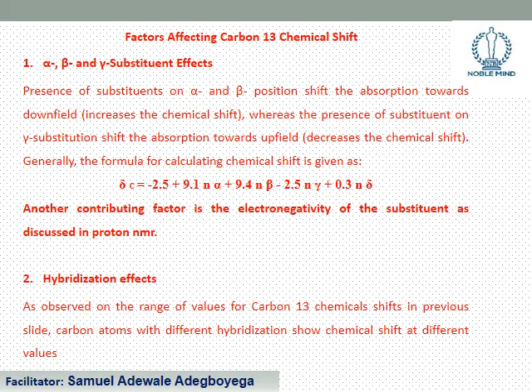You say an increase in chemical shift. We have discussed that in the previous presentation, where we talked about proton NMR. So I'm referring to that. Read more about or watch the presentation about proton NMR, so all the references will be clear to you.